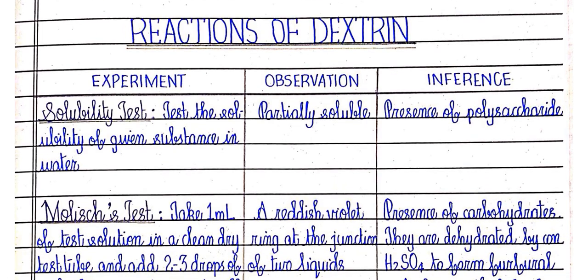Solubility test. Test the solubility of the given substance in water. Partially soluble. Presence of polysaccharide.